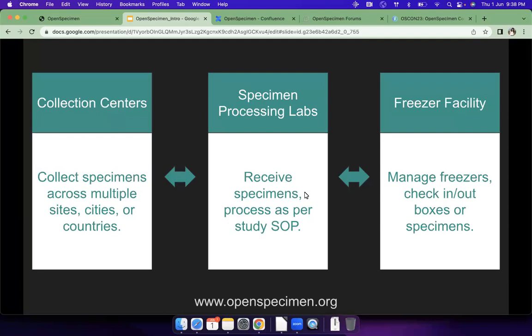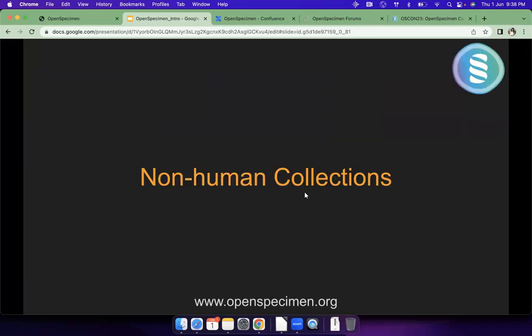Although the backend security handles all the security of the data, the URL would be publicly accessible so that users across the globe can access it. Or if you want, you can just install it within your network so that only users within your university can access it. So there are, again, multiple ways to install the application. Again, it is left to your choice. We can also host it for you on the cloud. That is also an option.